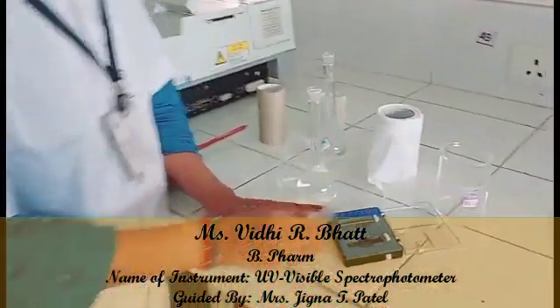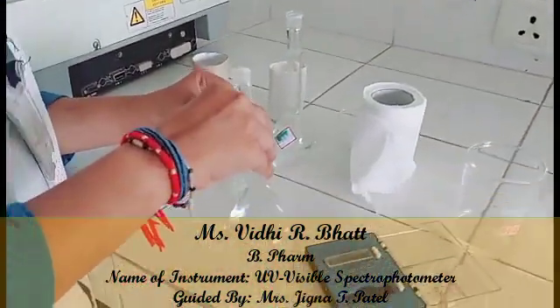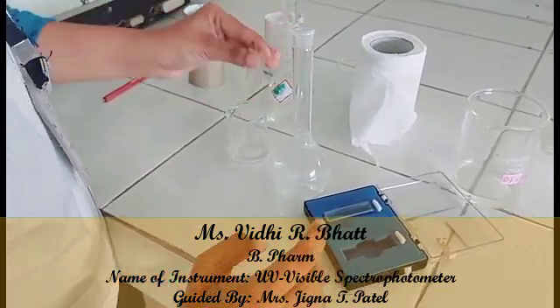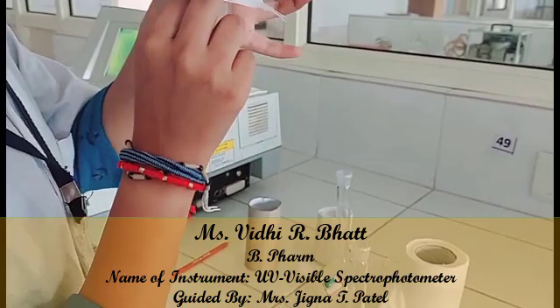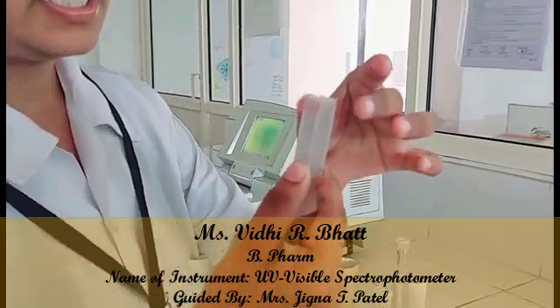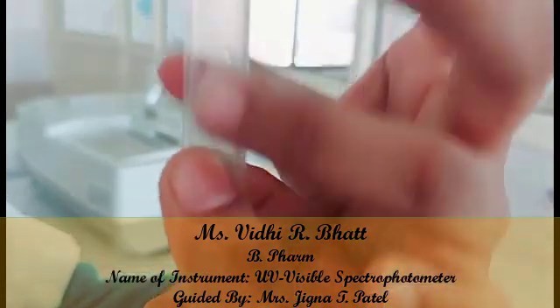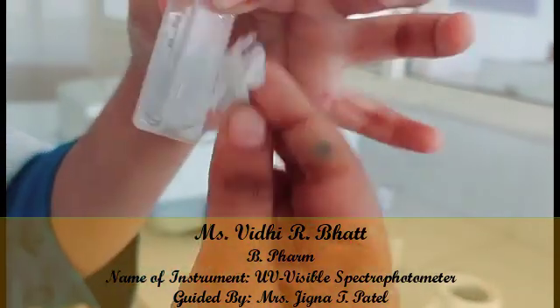We will take a PCM solution for the experiment. First, we will wash the solution cuvettes with the solvent solution which is 0.1 molar. The cuvette is made of a special type of glass known as quartz, and it has 4 surfaces — 2 transparent and 2 opaque. We must hold the cuvette from the opaque surfaces to reduce experimental error.